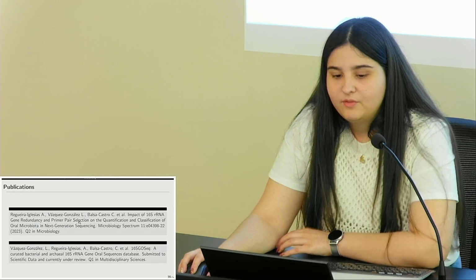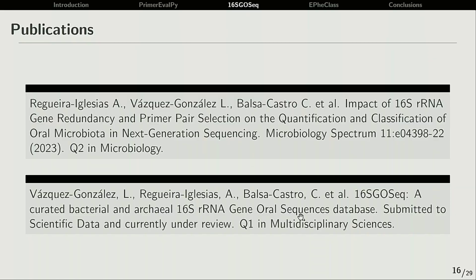We have two publications associated to this work. One is the database itself that is currently under review in Scientific Data, and another is a publication in Microbiology Spectrum exploring the impact of this gene redundancy in next-generation sequencing.